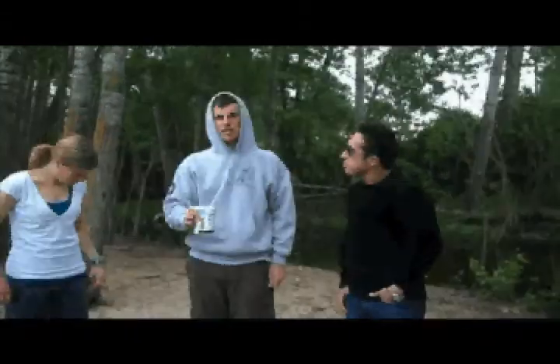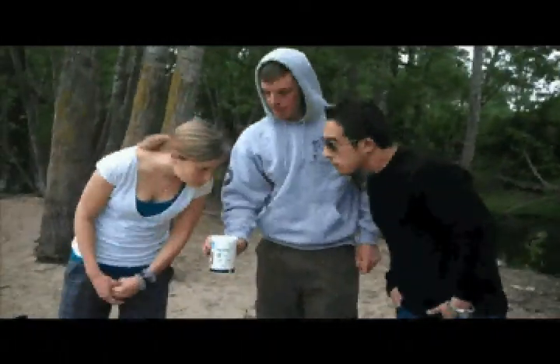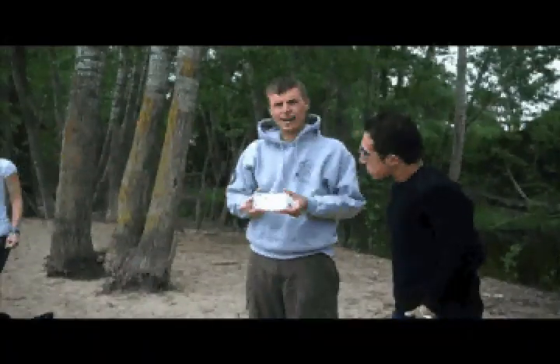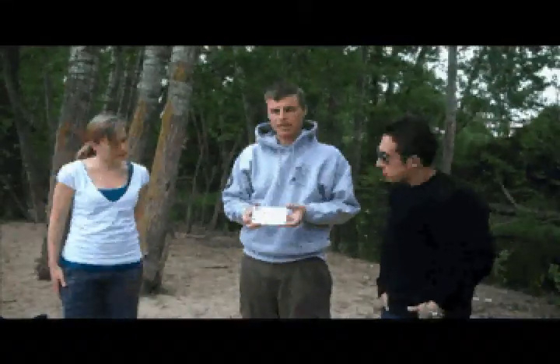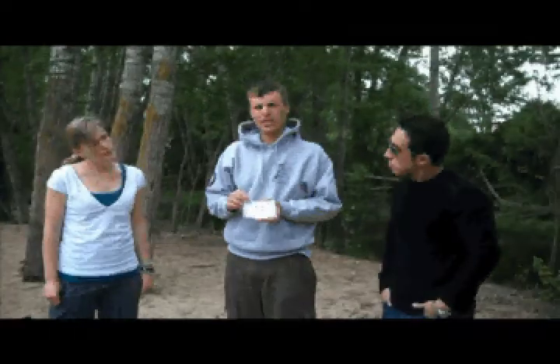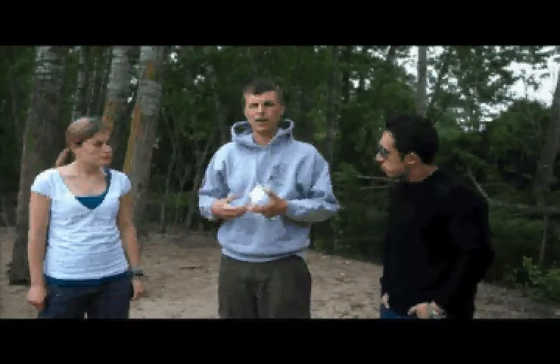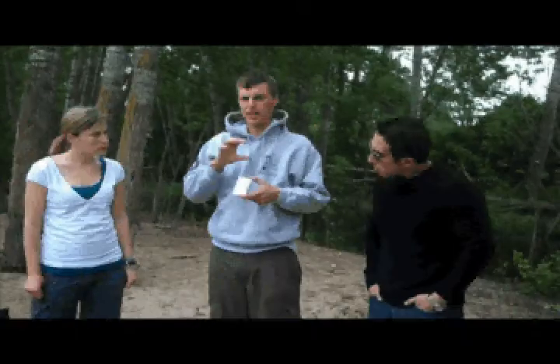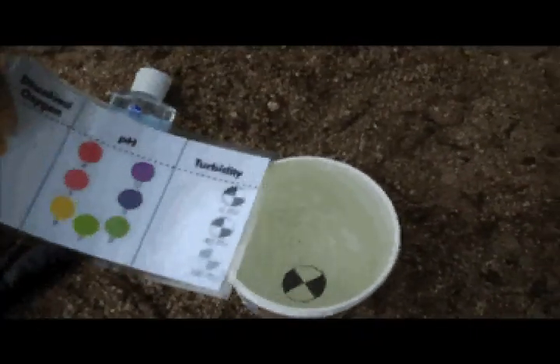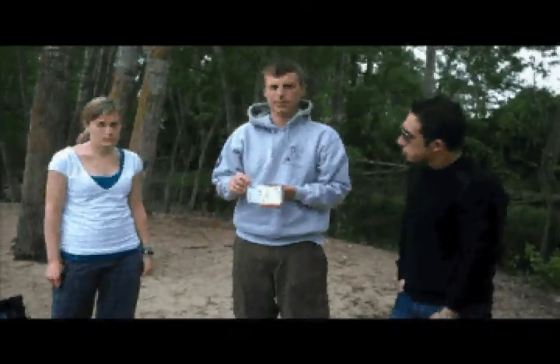Okay. The measurement we want to take is to look directly into the jug, and there's a small disc on the bottom. Can you grab that card? Water quality sampling unit. There's a small key card that has how to measure the pH that we'll do shortly, and the turbidity. Turbidity is a measurement of how much suspended material is in the water column, which indicates how much sediment is in the river, how much algae is flowing around, the general clarity and consistency of the water quality. Pretty broad range in this sample. It's a very coarse indicator, but we're going to go with 0. It's pretty clear. You can see the second disc very clearly at the bottom.